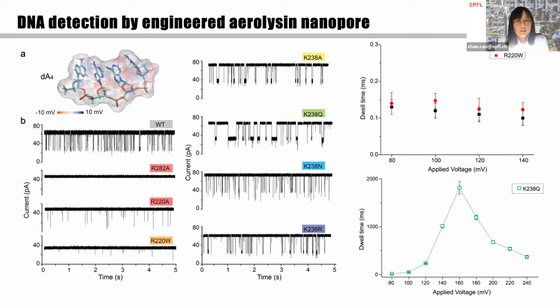There is one exceptional case, K238Q, before 160 millivolts. If you give more driving force, it will be stuck in the pore much longer. At some point, it starts to translocate. So there must be some specific interaction there, which we want to dig into more in the future to understand.